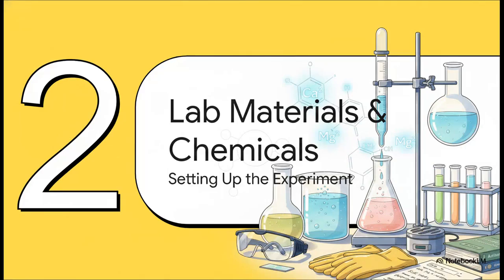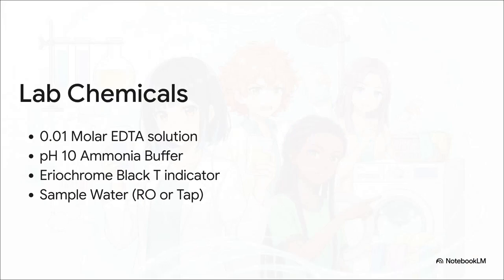All right, Section 2. Lab materials and chemicals, setting up the experiment. Let's meet our chemical cast of characters for the experiment. First up, we've got a 0.01 molar EDTA solution. Think of this as our primary titrant. It's the chemical that's going to actively hunt down and bind to the calcium and magnesium.